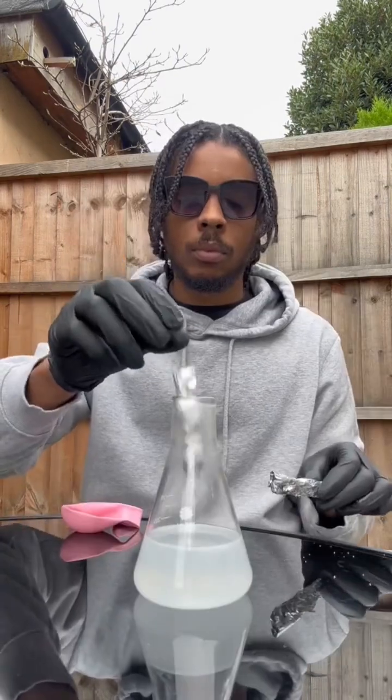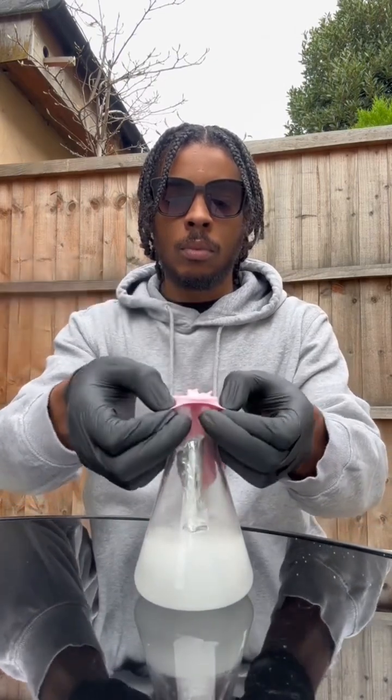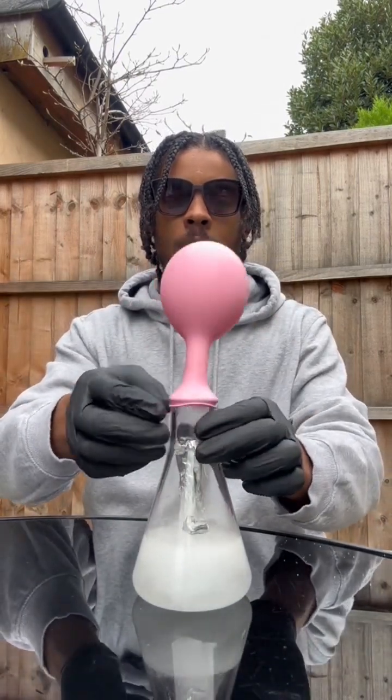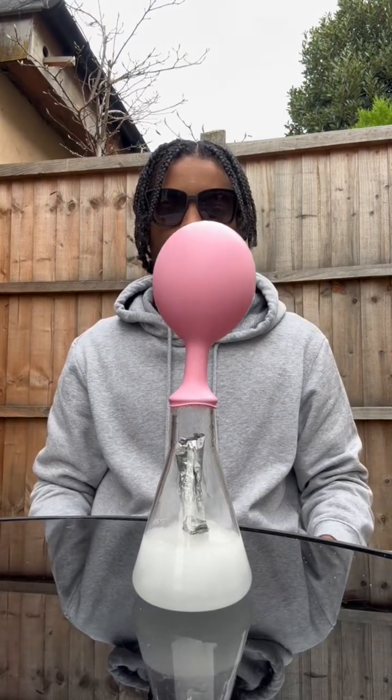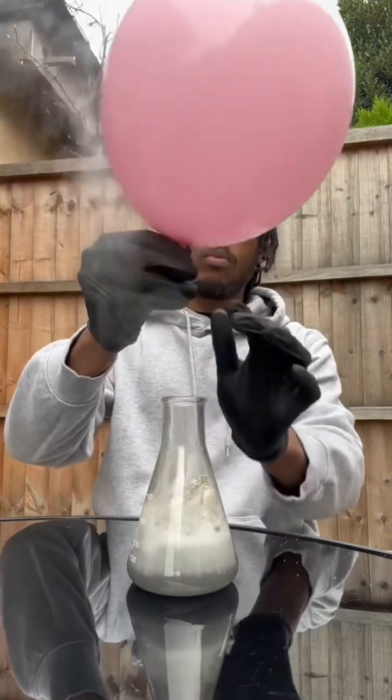Obviously goggles and things — you've got to protect the eyeballs. Alright cool, aluminium foil into the sodium hydroxide, balloon on top. Now straight away the balloon's filling up with hydrogen gas. That's because aluminium plus sodium hydroxide equals sodium aluminate plus hydrogen.